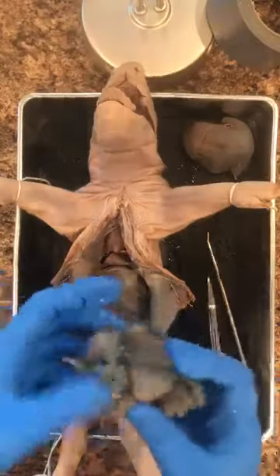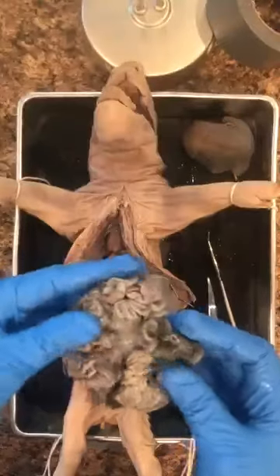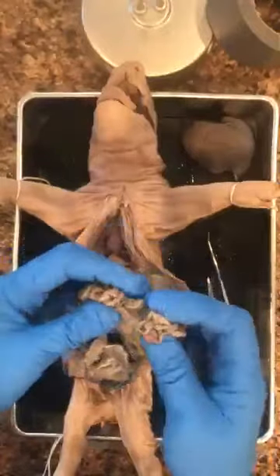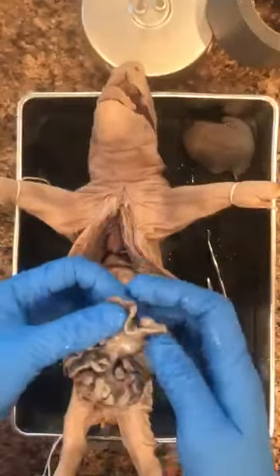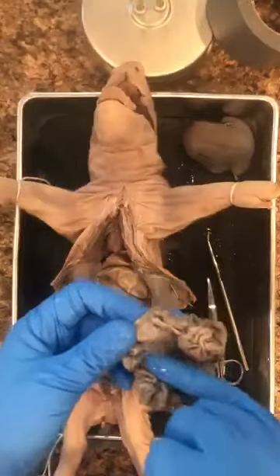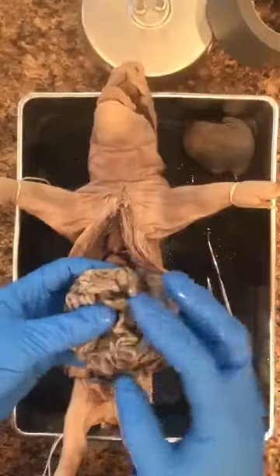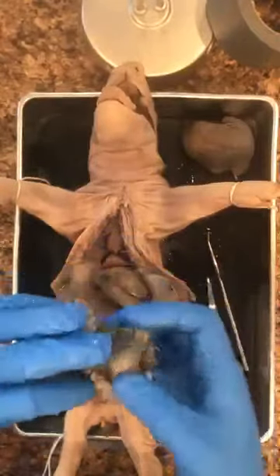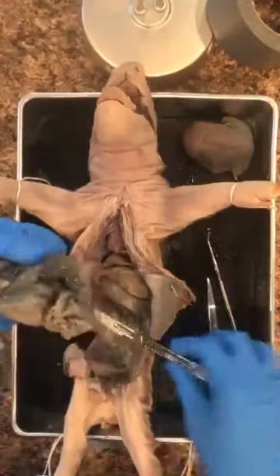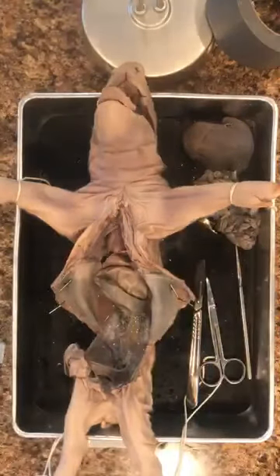All right, so here are the intestines. Once again, this is all small intestine right here. This is large intestine over here where it's really coiled together. It's all looped around. This is all mesentery. All those microscopic blood vessels are found right in here, and they take the nutrients from the food to the rest of the body. And there you go, there's the end of the large intestine, which goes to the rectum from there. Okay, I'll put that off to the side.